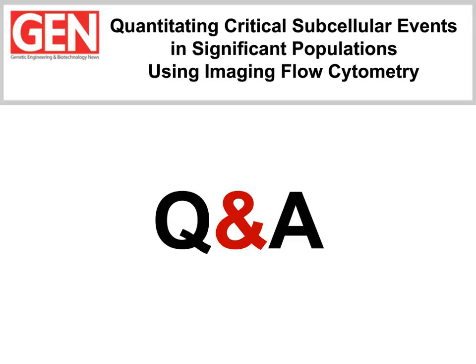Well, this question is quite difficult. As you know, there are a couple of papers claiming that cells can divide asymmetrically. I wouldn't be able to answer for every cell type, but what I can say is what I've seen analyzing B-cell division. Regarding surface antigens, I have been unable to detect any asymmetric segregation of surface antigen during B-cell division, but we haven't tried everything.